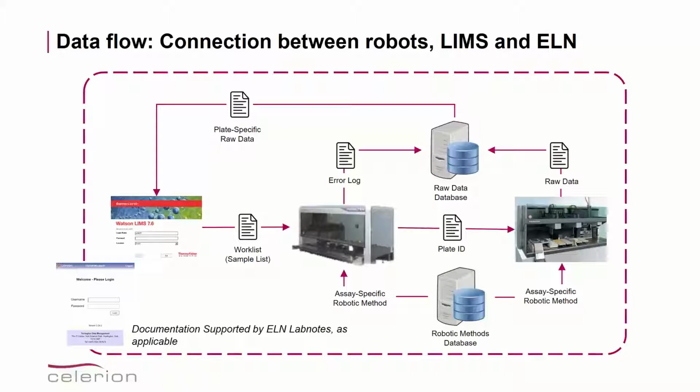Knowing how information flows between different systems allows Celerion to improve internal procedures as well as to ensure data integrity during the complete automated process. Taking time to elaborate such a data flow as the one shown here divides a complex system into its components, and by doing that, it helps you create more efficient procedures aiming to avoid gaps in data integrity. We can only recommend doing such a data flow early on during the validation of your system.